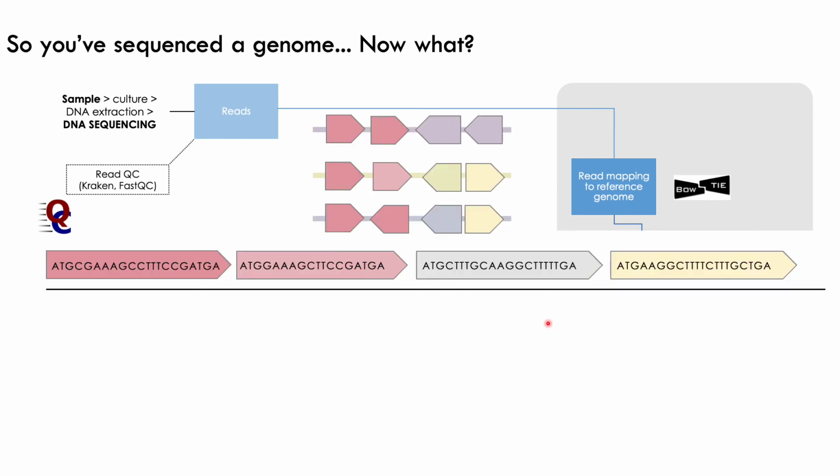So I just wanted to extend this example a little further. If you recall, we actually had 4 genes in our novel genomes, so now I've given our reference genome 4 genes as well. And we've still got these 2 core genes. Our third gene is now this grey gene, and our fourth gene is the yellow gene, which is shared between the green and blue genomes.